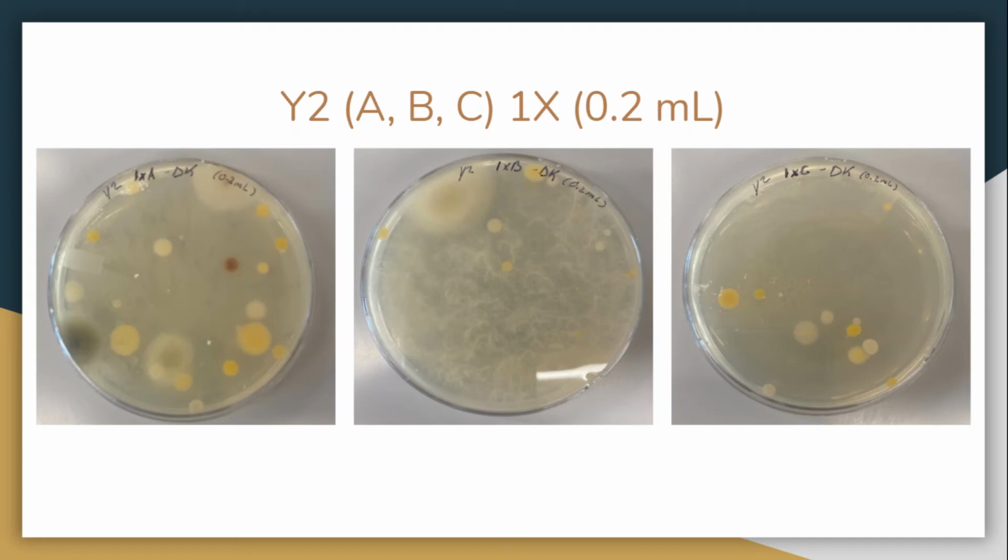The mean colony count for my plates per milliliter is 90, and the standard deviation is 25. The standard deviation is not so high, which suggests that there is not much variability between the samples.